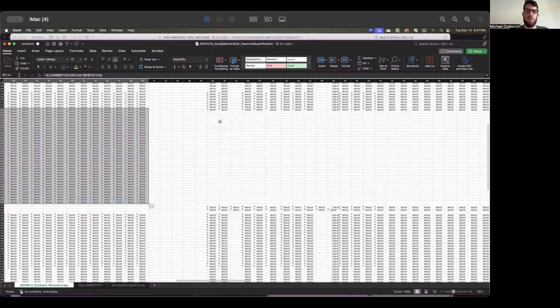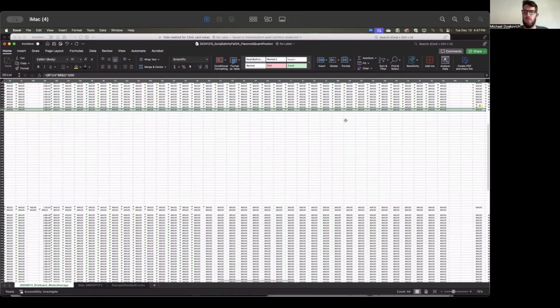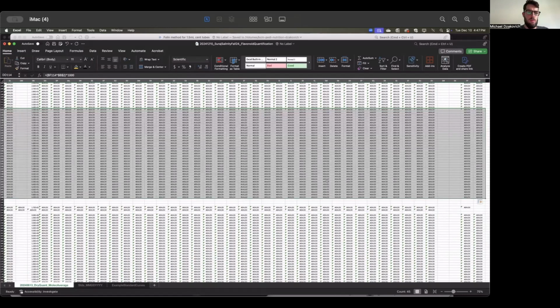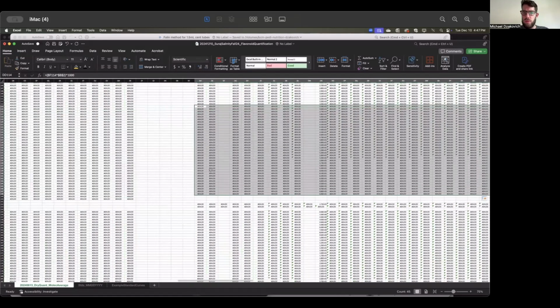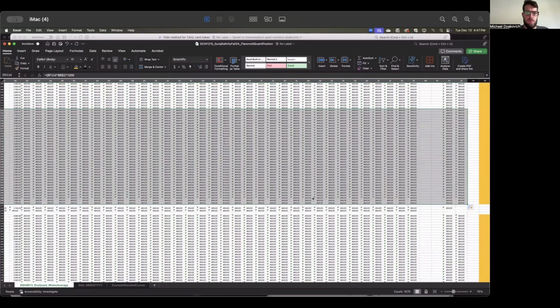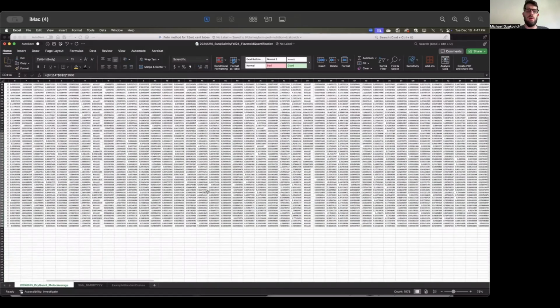And then same with over here. Gross mistake. Perfect. Okay, all right, so we've got that set up.